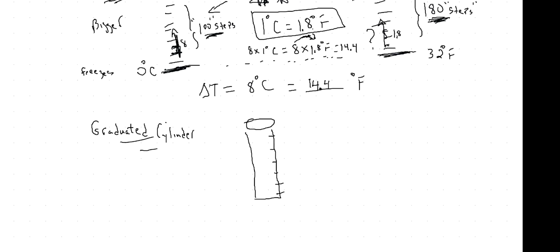Let's say that this is 6, and I'm just picking 6 maybe, and here's 5. It doesn't matter, I'm just showing you an example. Now in between you'll see there's many little markings, and usually there's, sorry, it's not that even.